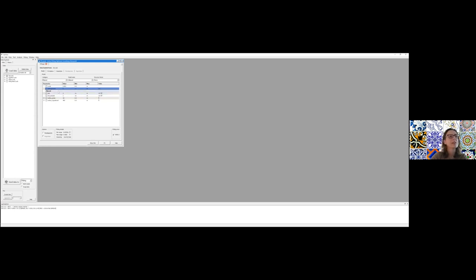The scattering length density of your protein. Now, a priori, you don't know it, but I gave you a few links for software that you can use to get a rough estimation of what to expect. And if you had used it for lysozyme, you would get a value of approximately 3.4 times 10 to the minus 6. So it's already times 10 to the minus 6 here in the units. So you just put in 3.4. Solvent is D2O, so it's 6.4 times 10 to the minus 6. And again, you can find that in the literature, but you could also calculate it very easily.